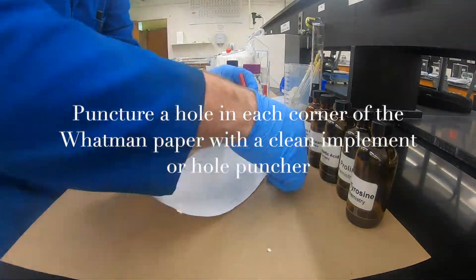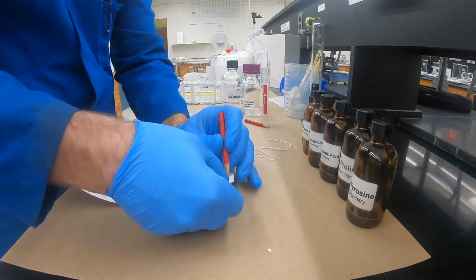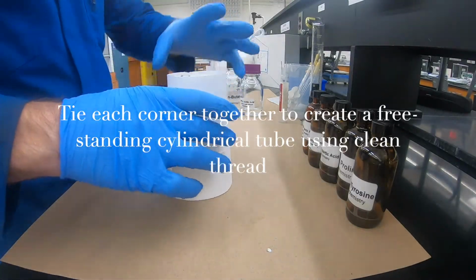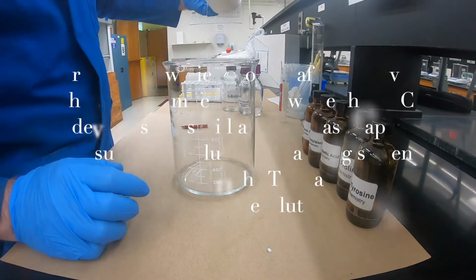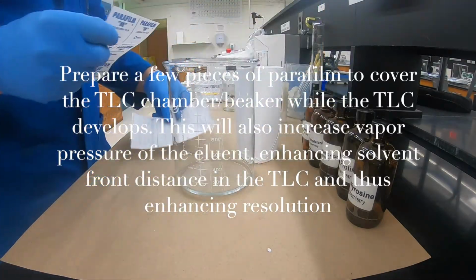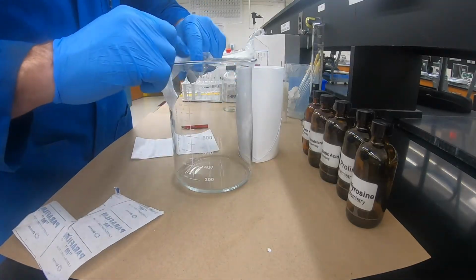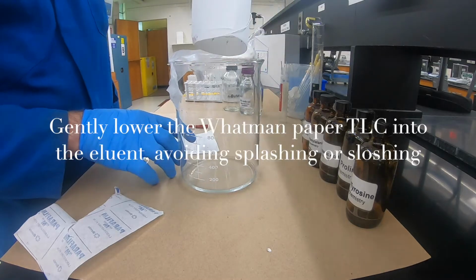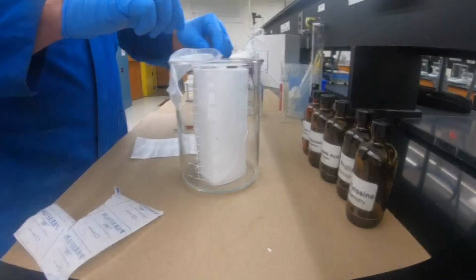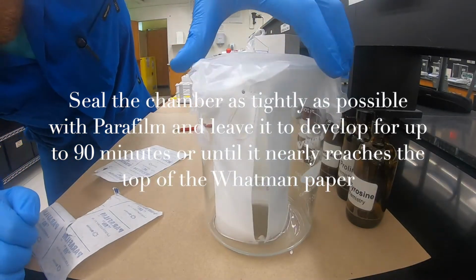We'll now take the TLC paper and punch a hole in each corner. We will use these corners to create a freestanding cylindrical tube using clean thread. We're going to cover that entire TLC chamber with parafilm. Parafilm is great for this, and it will keep the vapor pressure high in the chamber. Gently lower the TLC plate into the chamber, avoiding splashing or sloshing. Now we will seal the TLC chamber as tightly as possible and allow it to sit for 90 minutes.